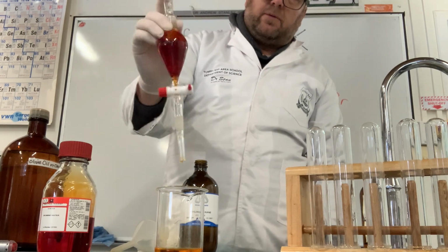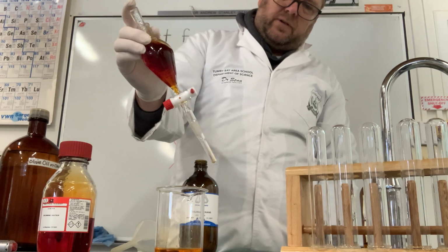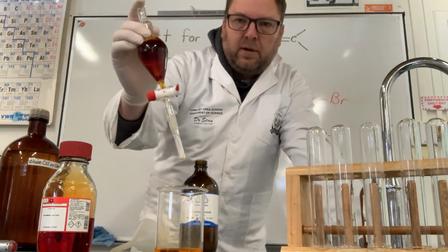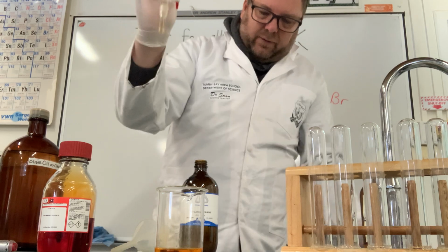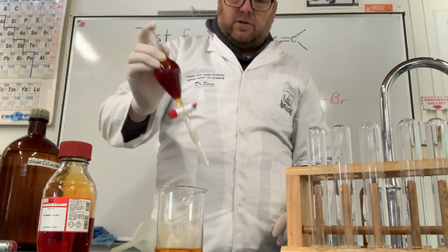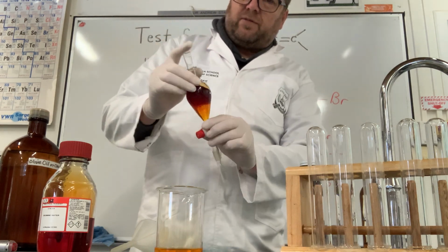And then when I do this again, we'll see that bottom layer get lighter again, hopefully. Yeah, and we can even see that more deep orange red in that top layer. So we'll keep going and get as much of that as we can. I won't do another one, that'll be enough. Shake that. Making sure I'm keeping my finger on the stopper.